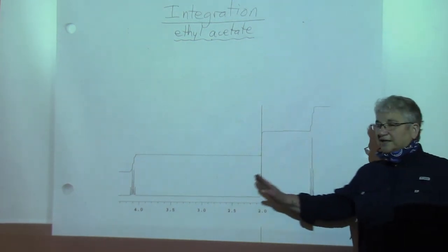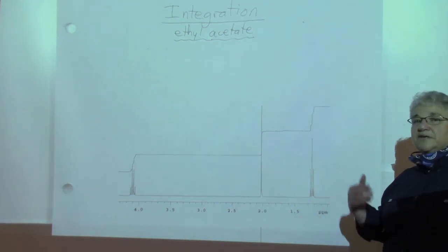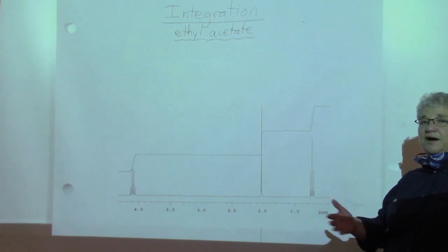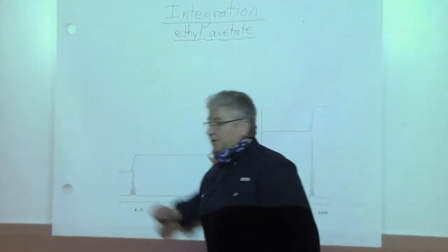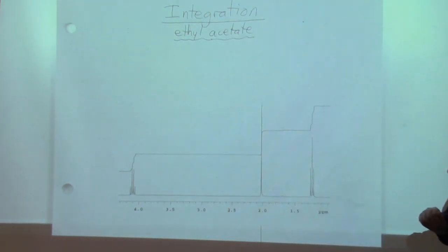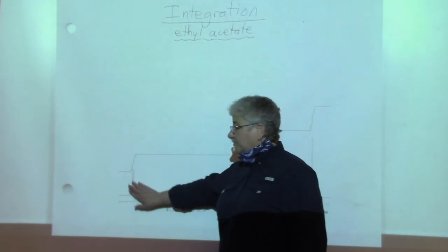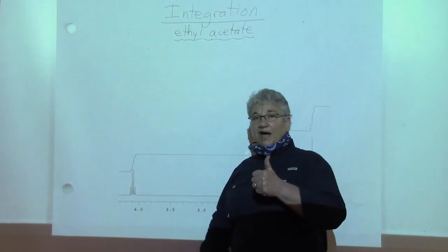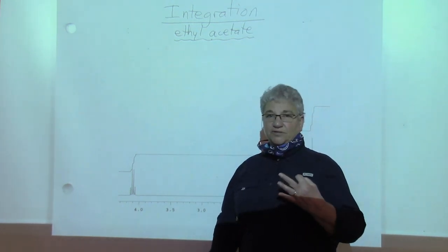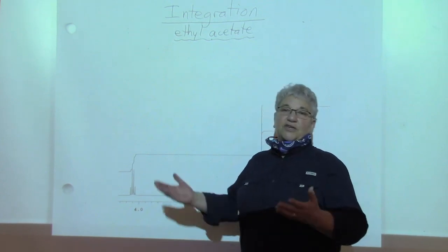So if I were to look at this spectrum, it looks like to me that there are 3 different types or 3 different kinds of hydrogens present here. I see one here, and one here. And so when you integrate a peak, what I'm curious to know is I know that this is one type of hydrogen, but is it truly one hydrogen or 2 hydrogens or 3 hydrogens, right? And I can't tell that from just looking at the peaks.